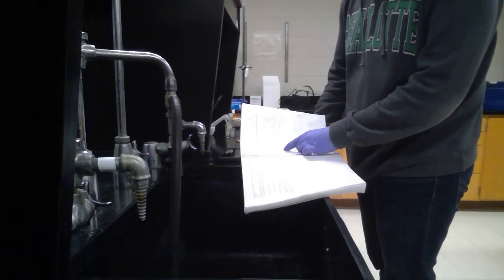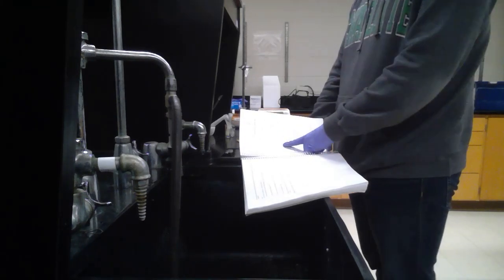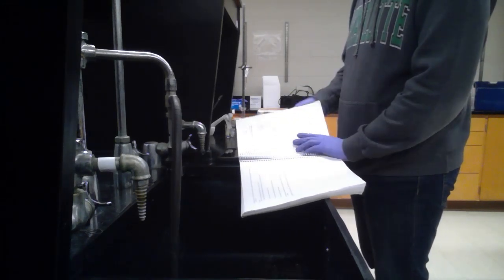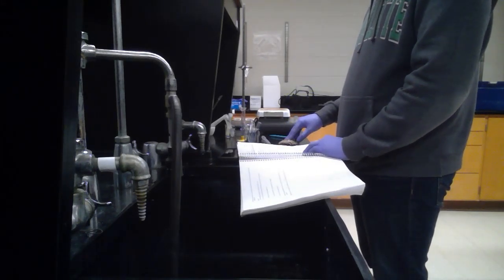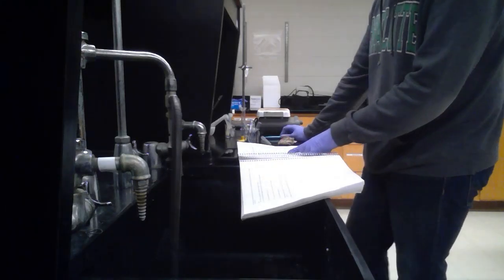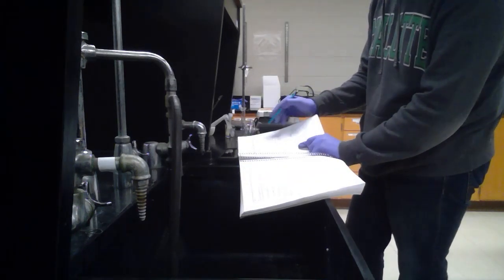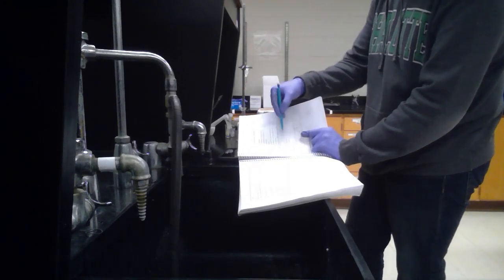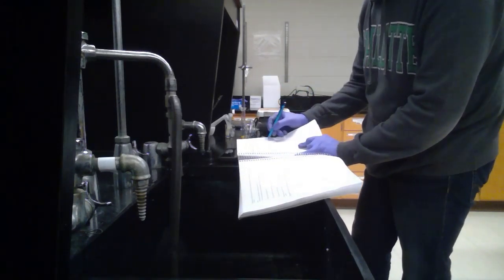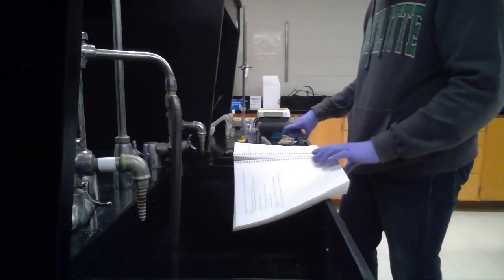For this part here, it's for number eight. It asks to estimate the weight based on the chip sample. Well, we don't know what kind of chips these are. So we're going to mark that part out. The grams here, just don't worry about that part. We're just going to assume that this uncorrected percent is your corrected percent. We're basically just skipping the part where we're correcting the carbohydrate weight. So all of these two things right here are going to be the exact same data down here.